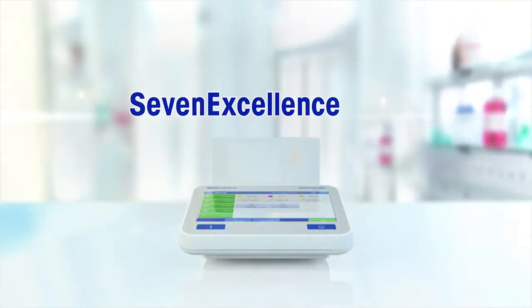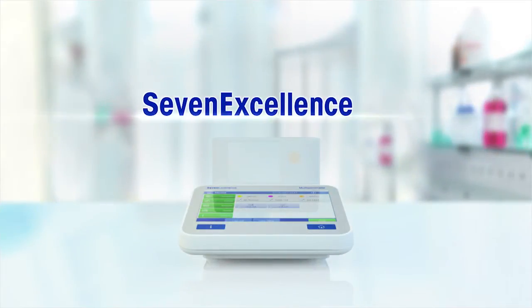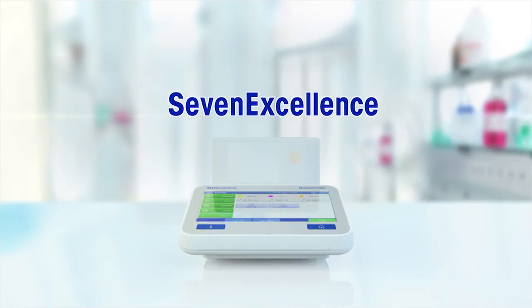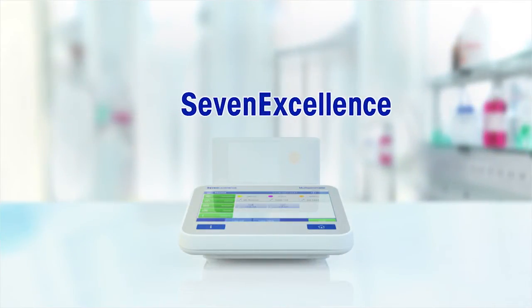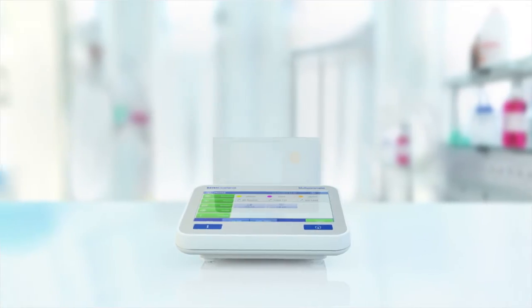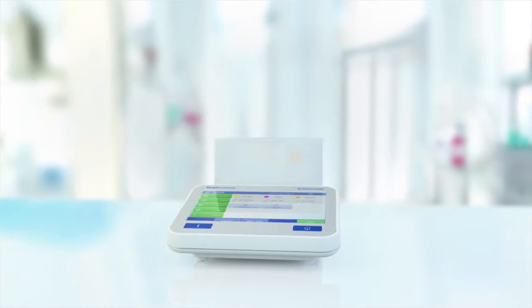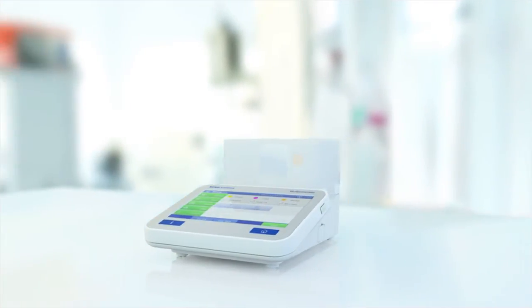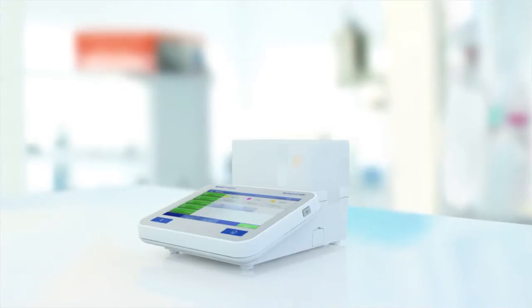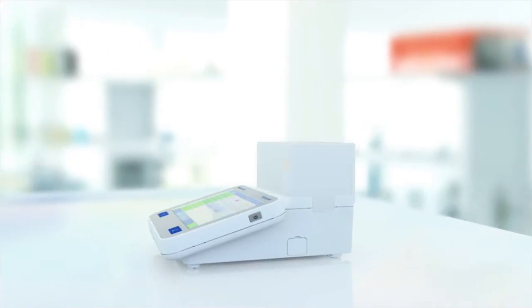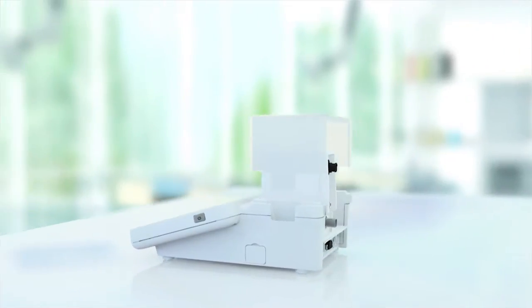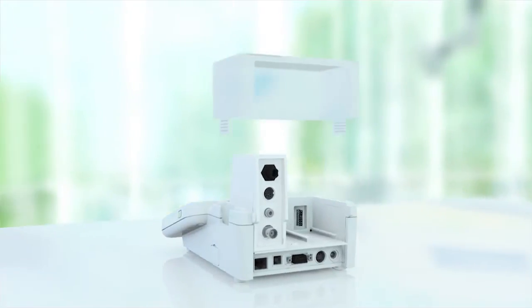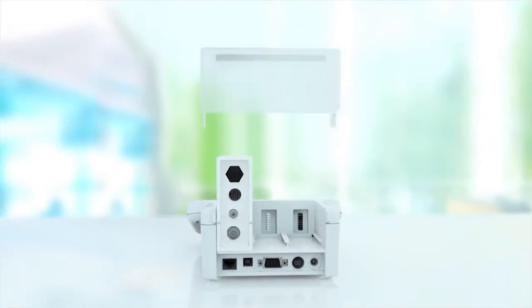Mettler Toledo proudly presents the new SevenExcellence multi-parameter instrument. pH, conductivity, dissolved oxygen, or ion concentration can be measured simultaneously according to one's needs, hence optimizing workflows and increasing efficiency.